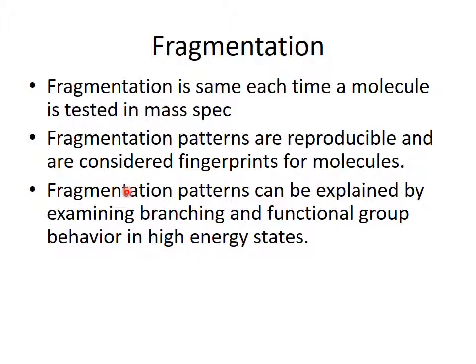Fragmentation patterns for molecules that have not been identified can help you determine the structure by looking at the branching and the functional groups and figuring how the molecule can decompose. And that's what we're going to go into a little bit more than what we did in those previous analyses. You were probably overwhelmed by that idea, but I'm going to show you how to make it simpler.